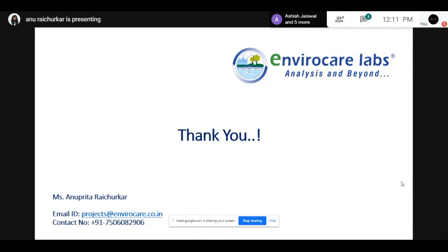Okay. What if we have to test several samples at one time? Can multiplex PCR be used? Yes. Multiplexing is actually different, but when you want to run multiple samples at a go, in PCR you can run many samples together. It is a 96 well plate, and there are even higher versions of it. You can sometimes run around 200 to 300 samples together.